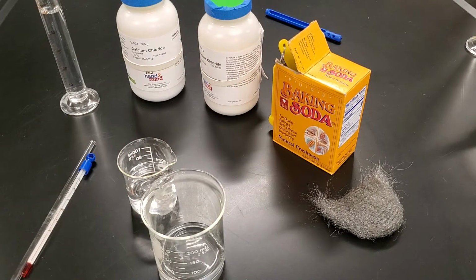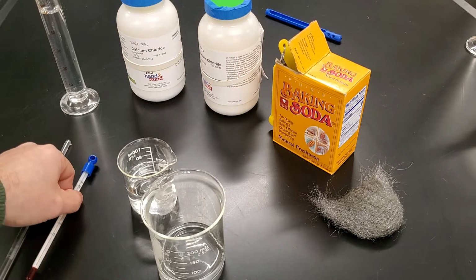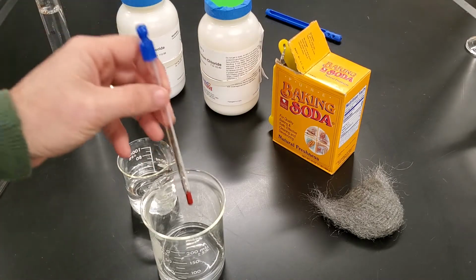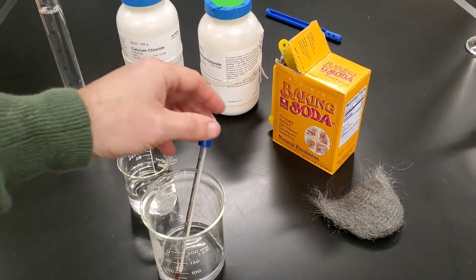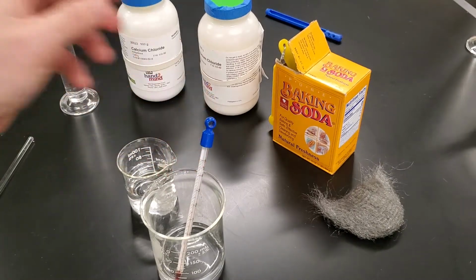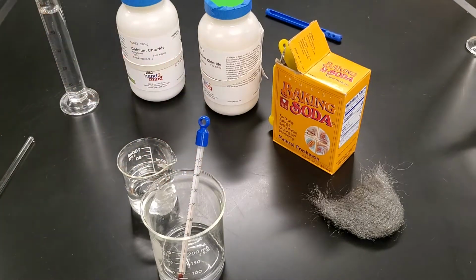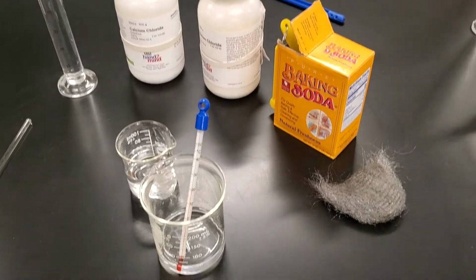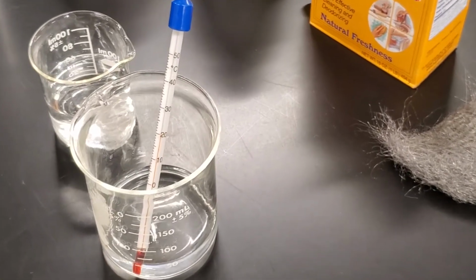Next, measure the temperature by placing a thermometer in the vinegar and waiting 1 minute before you record the temperature. So we will set that in there. We will give it 1 full minute and then measure the temperature and make sure that we record it onto table 2. So we could probably zoom in here to see the temperature and if it might change from what it is currently.